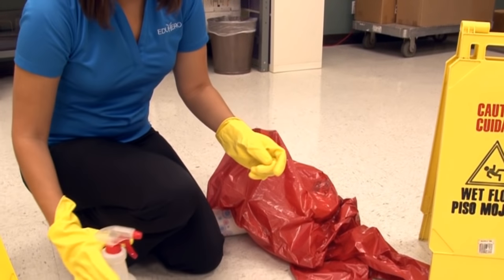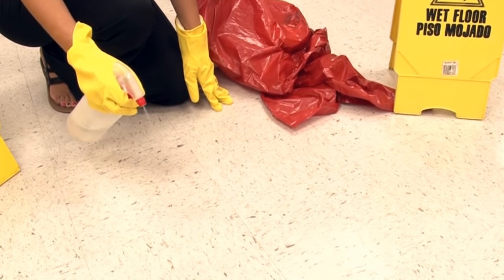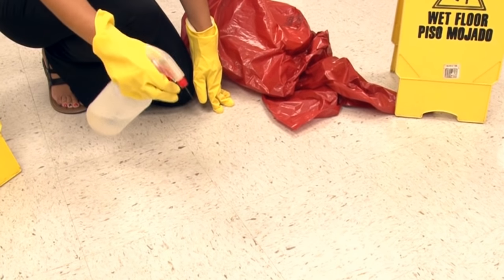Put on your third pair of gloves and spray the area again with bleach solution. This time, let the area dry on its own.